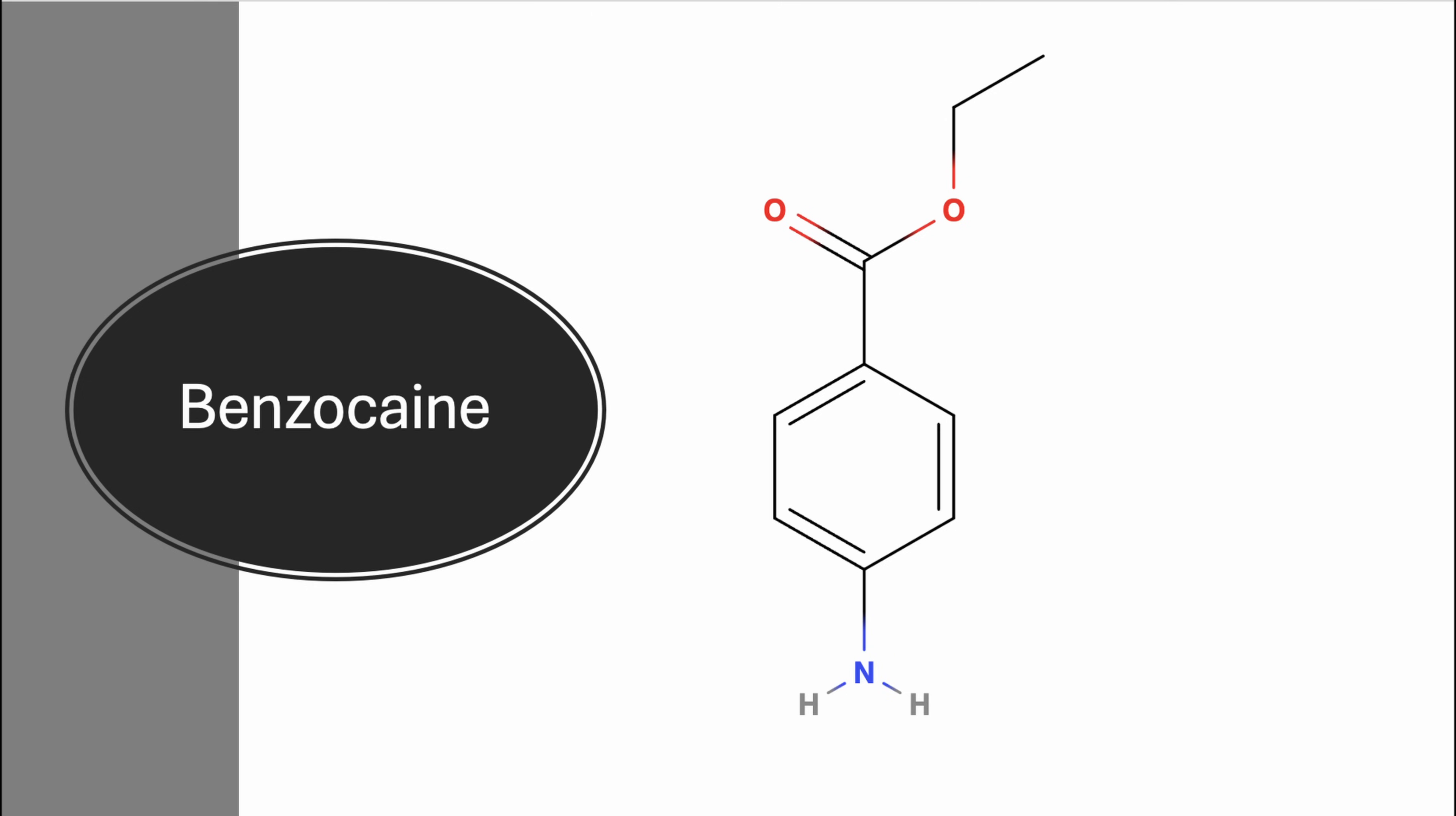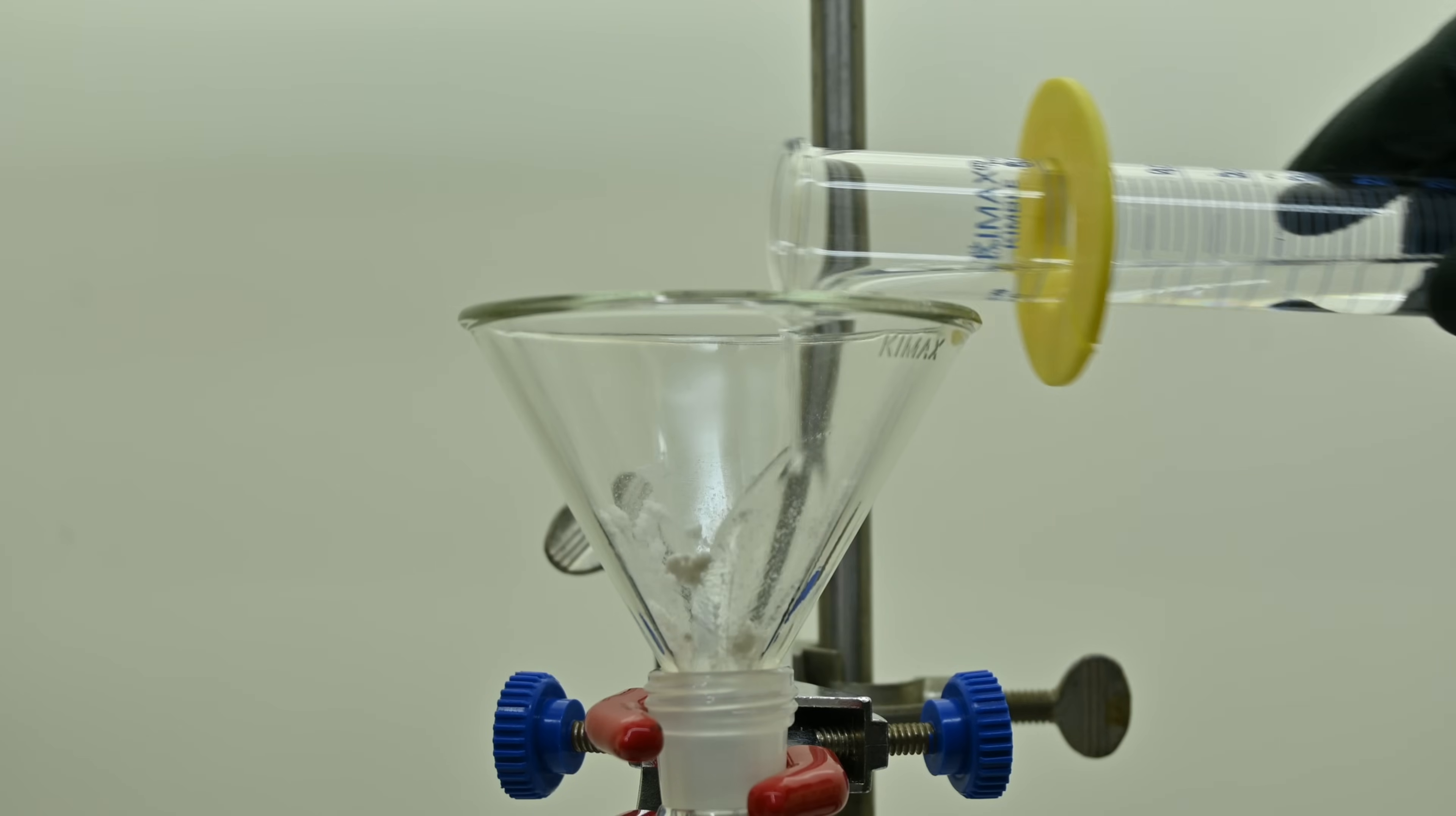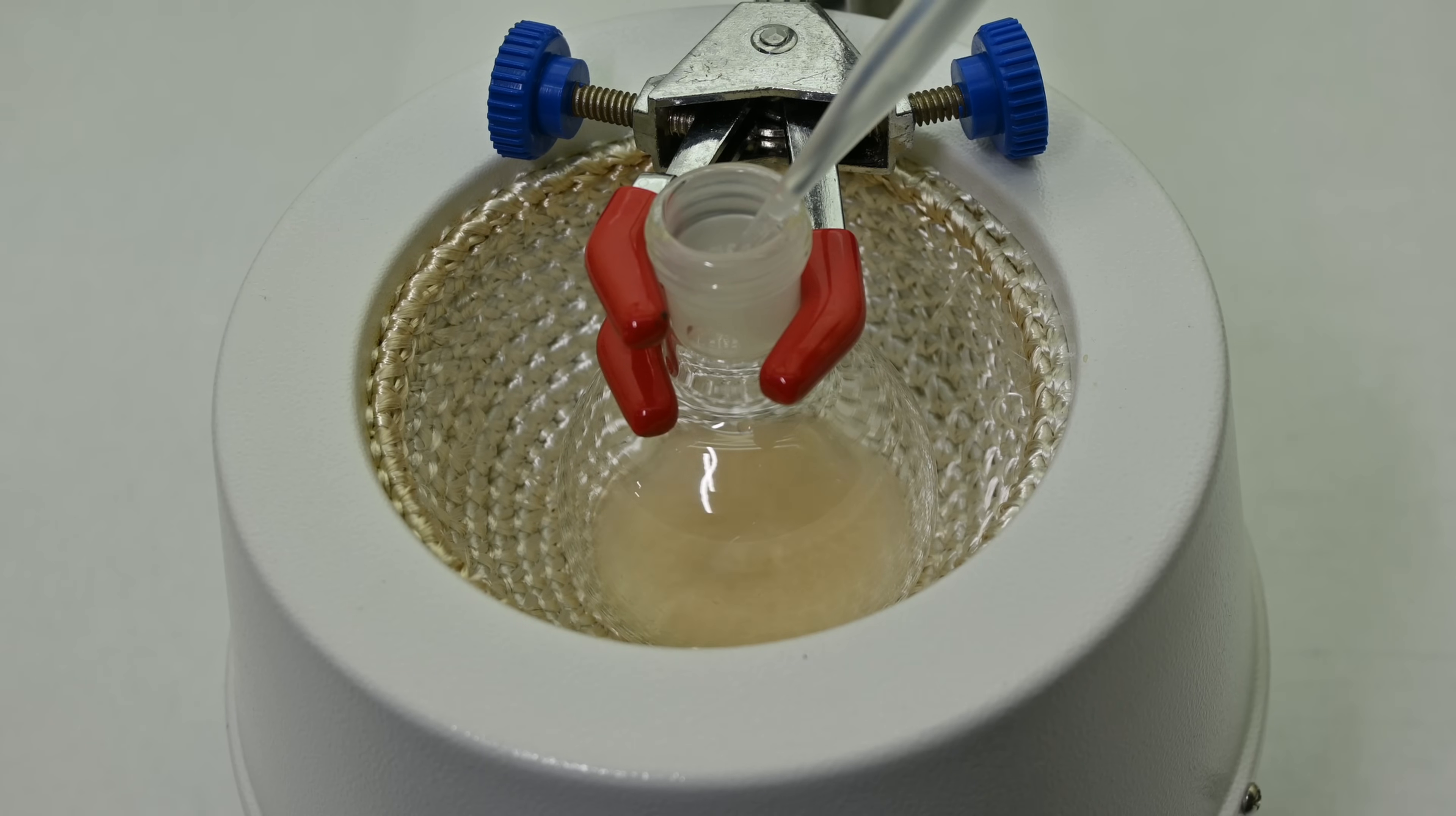Now we're onto the formation of benzocaine. I start by placing 2 grams of p-aminobenzoic acid into a 100 mL round bottom flask. To this I add 20 mL of ethanol, which both acts as the solvent and as the reactant in the esterification process. I then carefully add 1.5 mL of concentrated sulfuric acid to the mixture. Since sulfuric acid is highly corrosive and reacts exothermically with water and alcohol, I add it slowly, drop by drop while stirring the flask. The sulfuric acid catalyzes the Fischer esterification reaction by protonating the carboxylic acid group, making it more electrophilic, and thus more reactive towards ethanol.